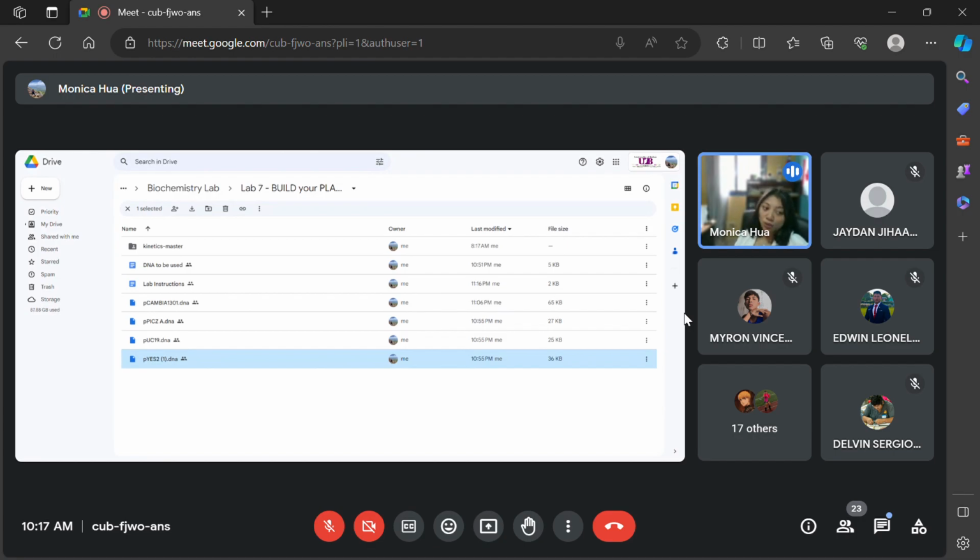And plus, if I don't want to open Benchling, but I want to know what my DNA sequence looks like, then I just double click and SnapGene will show it, instead of one long 18,000 base pairs of ATGC. It looks more organized. So it just helps you visualize the plasmid.